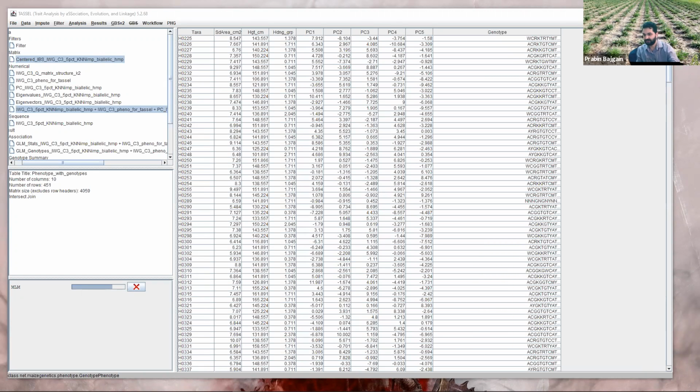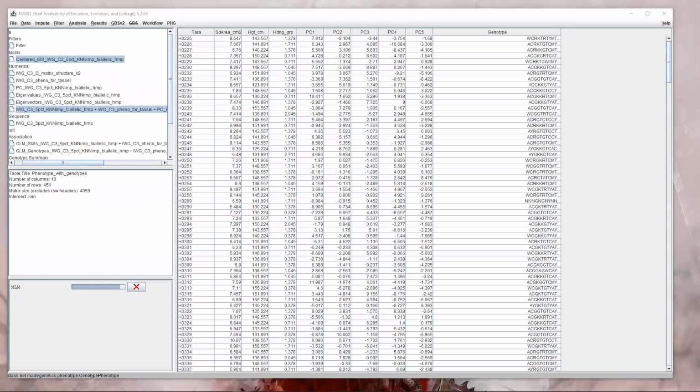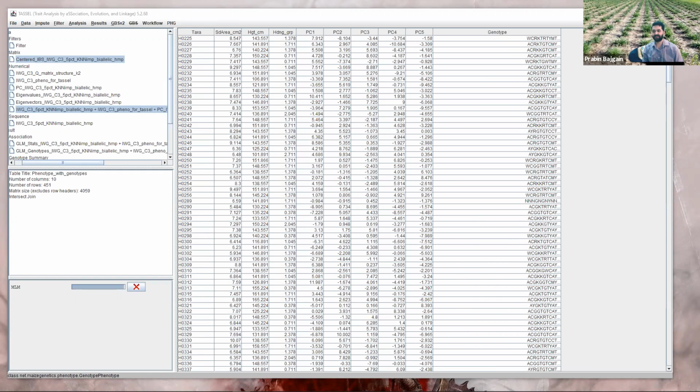Okay, almost done. Does anyone need me to retrace my steps on any of the things we've done thus far? If I'm going too fast, please stop me. I can go through this again too if needed. Oh, we have one yes. Okay. Yeah, let's compare the results and we'll go through all of these again. Okay, thanks. Clean slate.